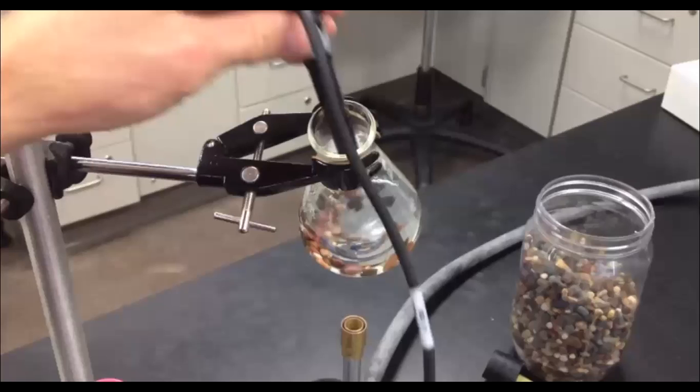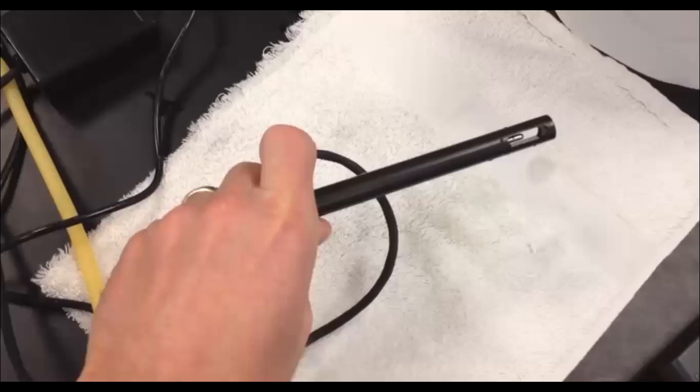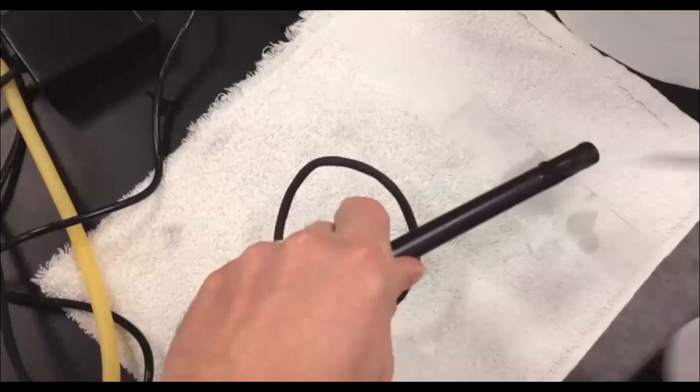Carefully remove the conductivity probe from the salt water. Over a towel, rinse the salt water off the conductivity probe using distilled water. Set the LabQuest aside. You won't need it until you've completed the experiment. Reset your Erlenmeyer flask. Put the cover back on. Put on a sweet pair of goggles.